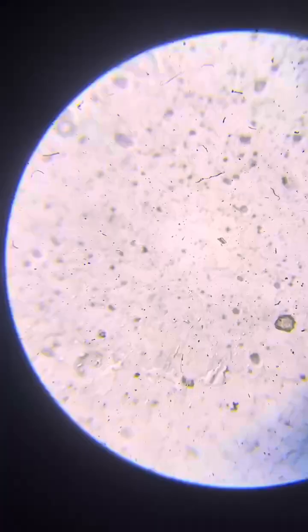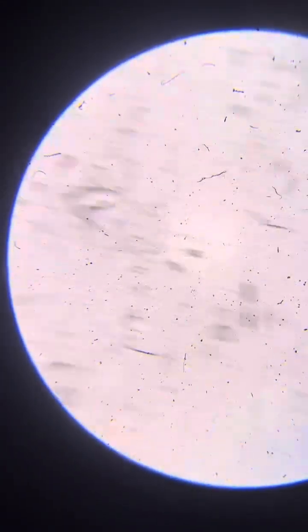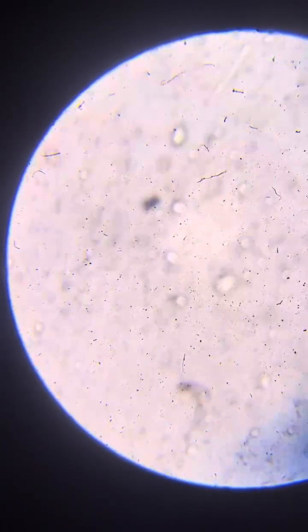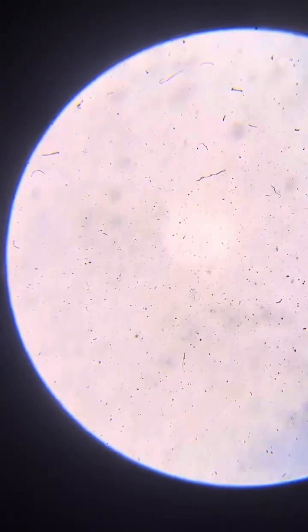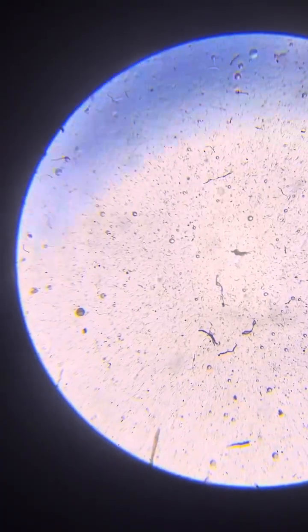So we do see quite a bit, but not spread evenly on the slide. So what's the spread problem? Maybe it's not about how it's spread, but about the cover, because it's hovering, it's not well placed. Yeah, it wasn't well positioned because of the mechanical problem.